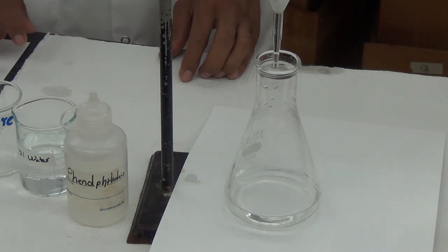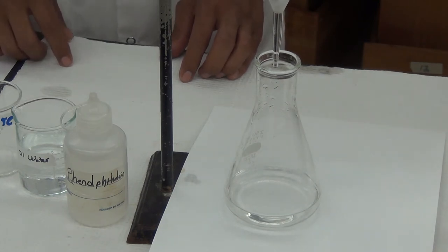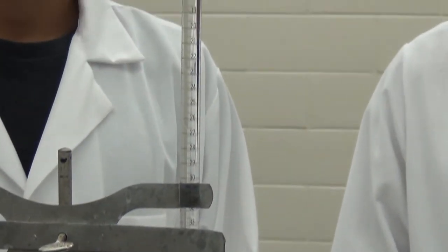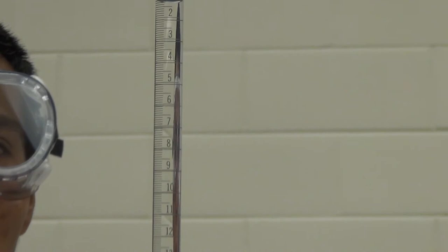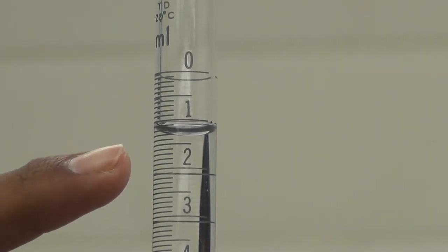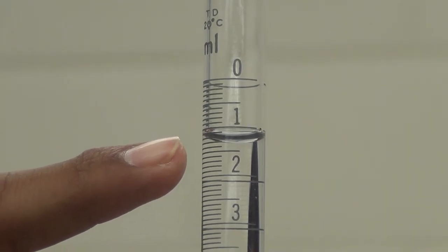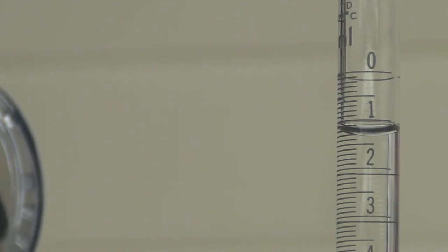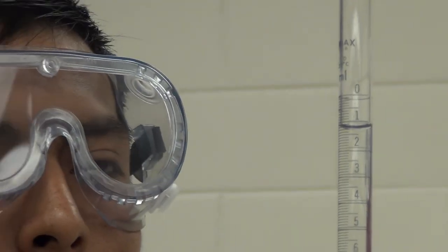To find the volume of the titrant used, we need to take two measurements from the burette, one before we begin, the initial volume, and one at the endpoint, the final volume. To take a measurement, find the level of the solution and read the value at the bottom of the meniscus. Your eyes must be level with the meniscus for an accurate reading. Here the initial volume is 1.29 milliliters.